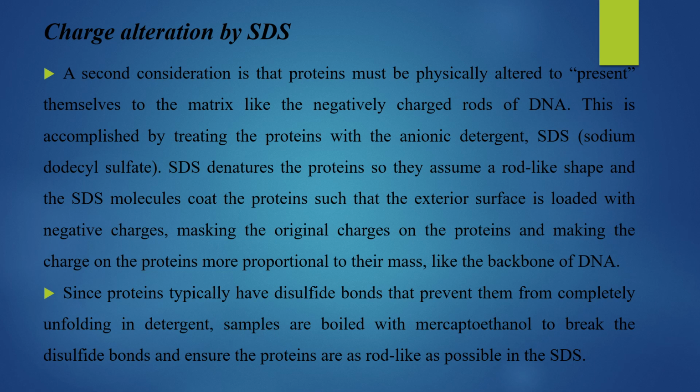So you are finding a way of pushing the proteins to behave similarly to the DNA by making them negatively charged, and then the size would increase or decrease the number of negative charges. Bigger, more negative charges; smaller, fewer negative charges.